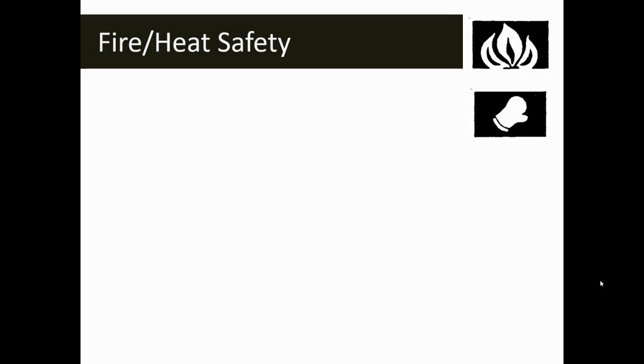The next two symbols we might see this year are the fire safety symbol and the heat safety symbol. In the upper right-hand corner of your screen, you see the open flame — that is your fire safety symbol, meaning you're going to be working with an open flame. This could be a Bunsen burner or a candle — something that's going to actually produce a flame or a fire.